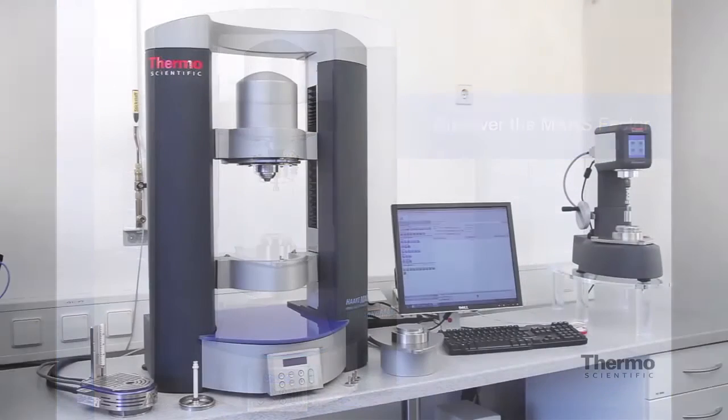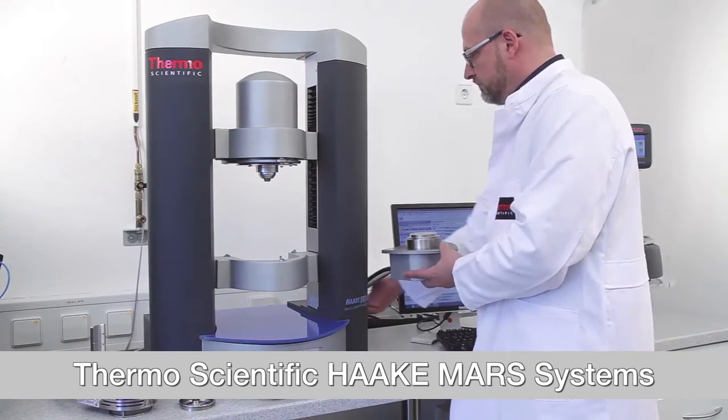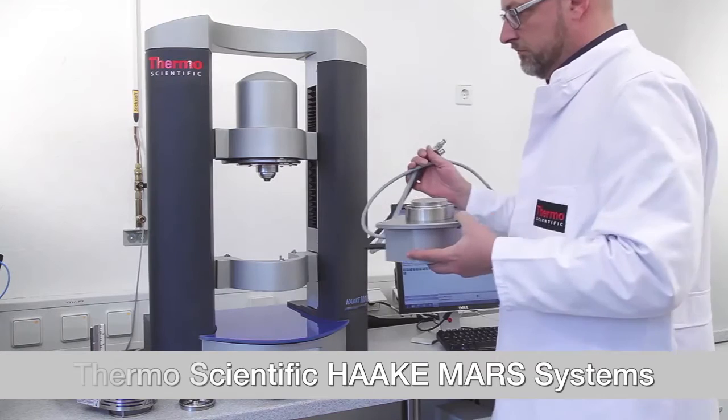Discover the MARS vector. Discover the ease of use features of the MARS systems.